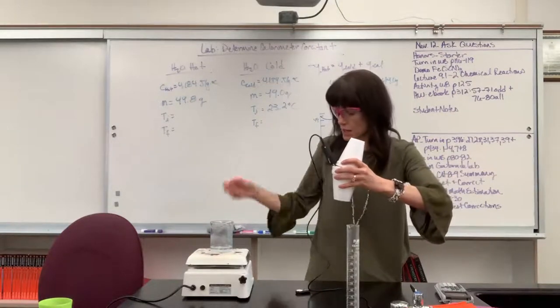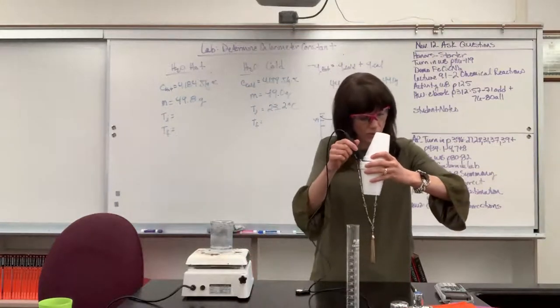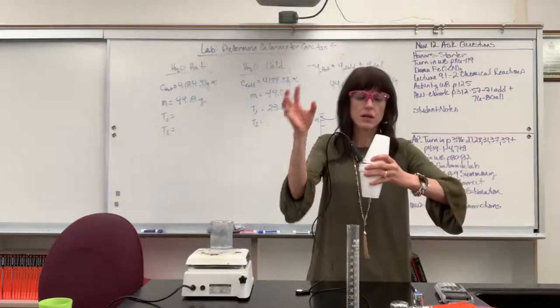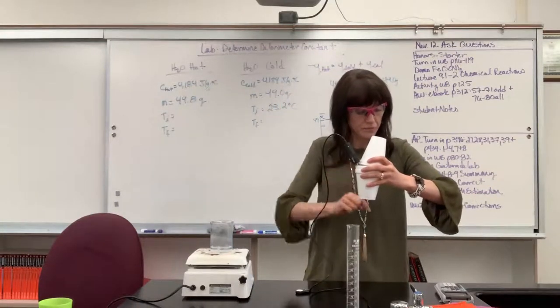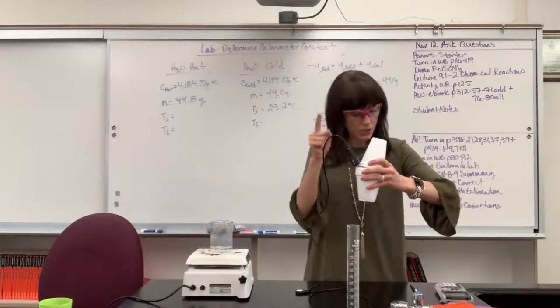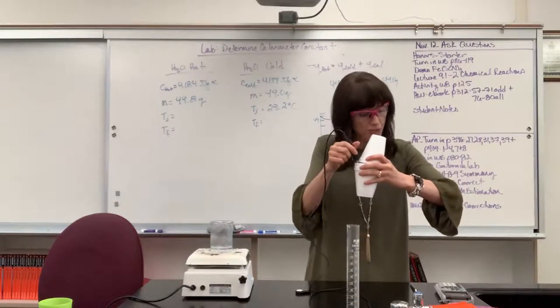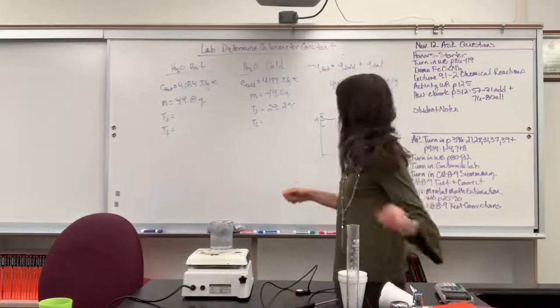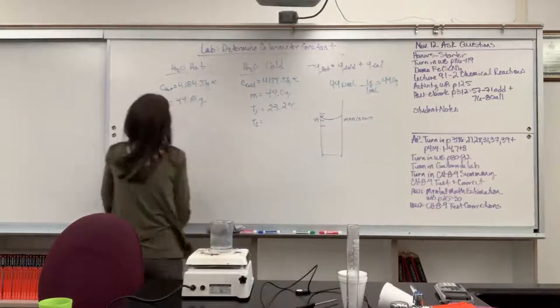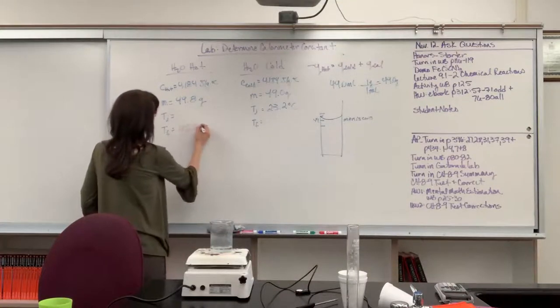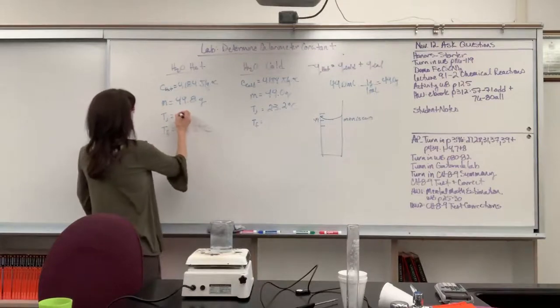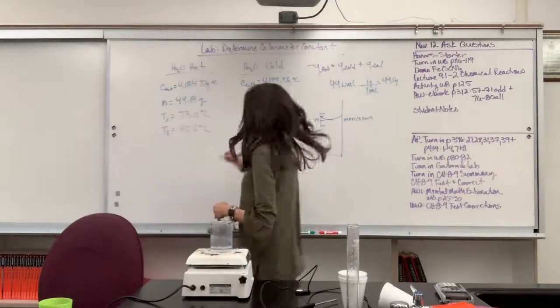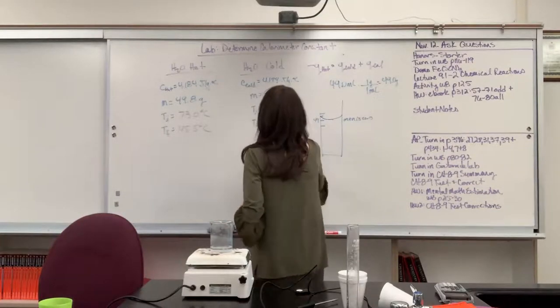I'm going to go ahead and turn this one off. Okay, and as I'm looking at this, I'm waiting for it to come into thermal equilibrium. Remember, the hot water went into the cold water. Hot water is going to cool down. The cold water is going to absorb the energy, and it's going to warm up. And we are stable now. It is holding at 45.5 degrees. 45.5 degrees. And I didn't write down the initial. That was 73 degrees. And then over here, thermal equilibrium, they're the same temperatures. 45.5 degrees C. Okay, great.